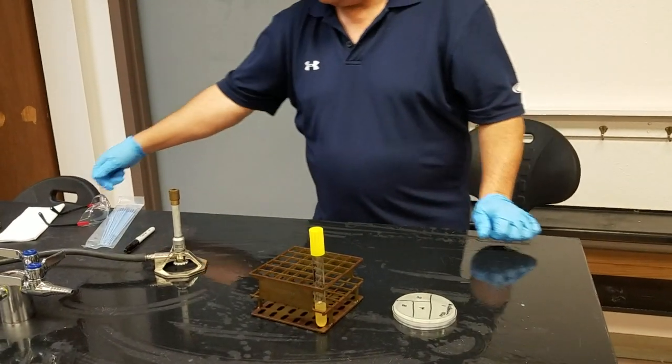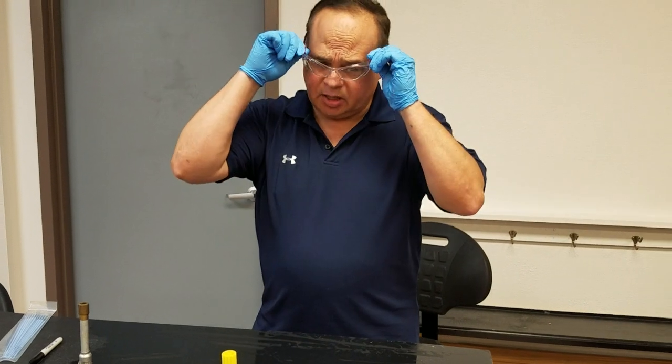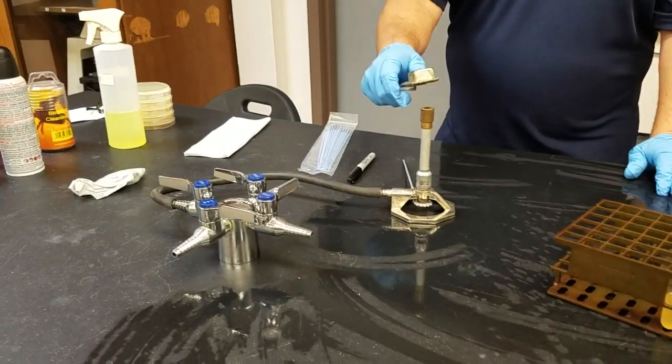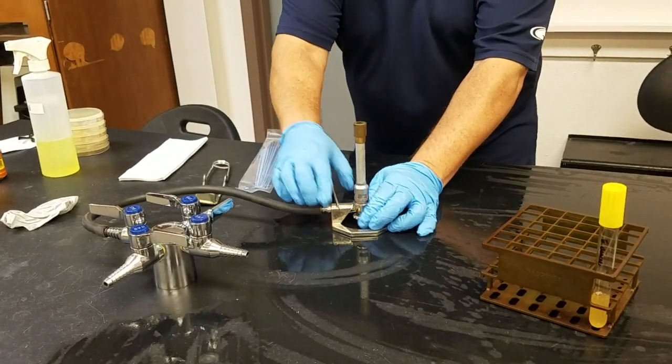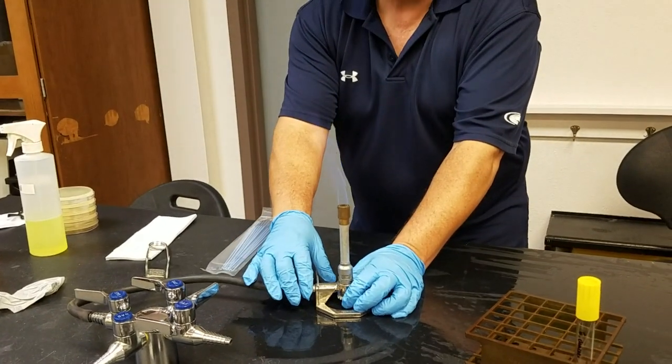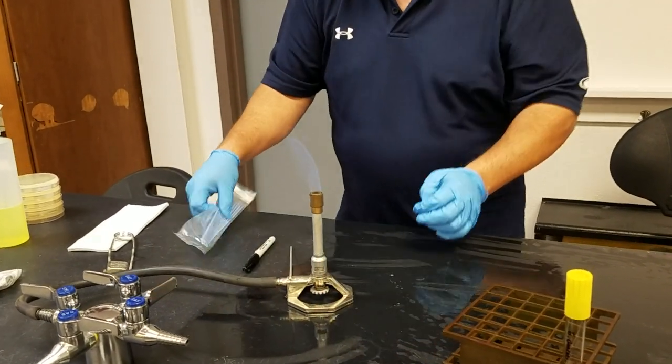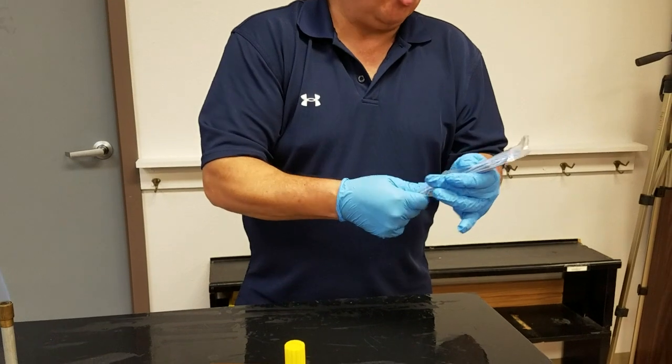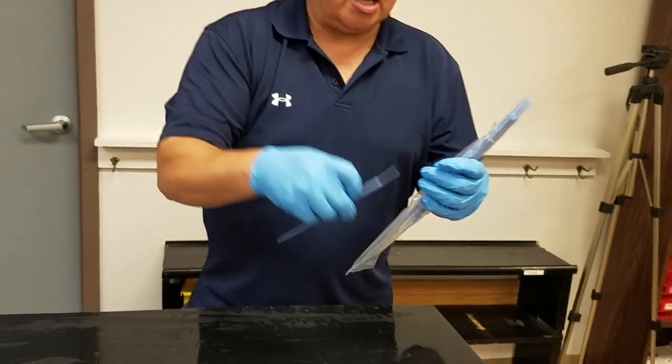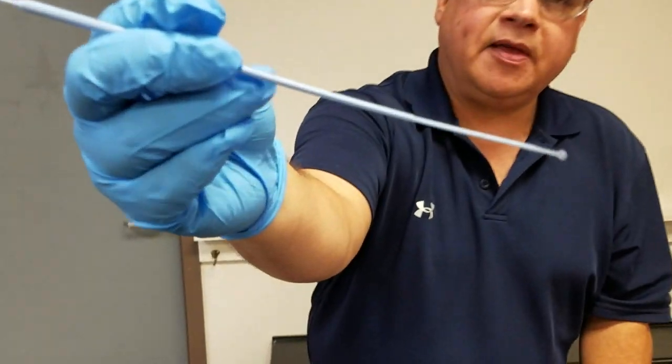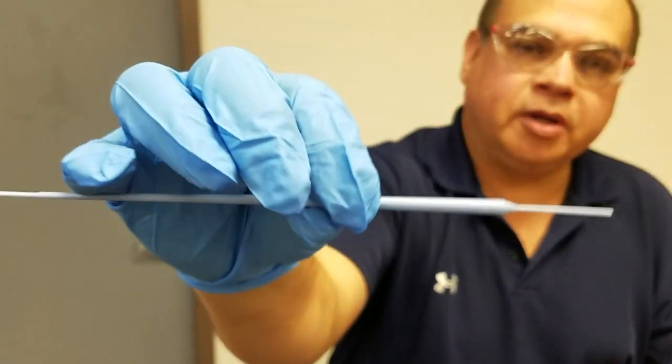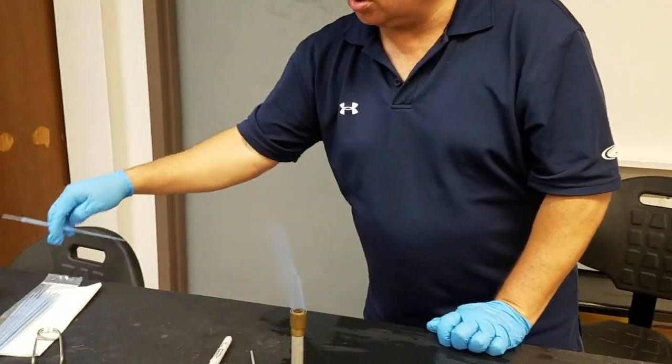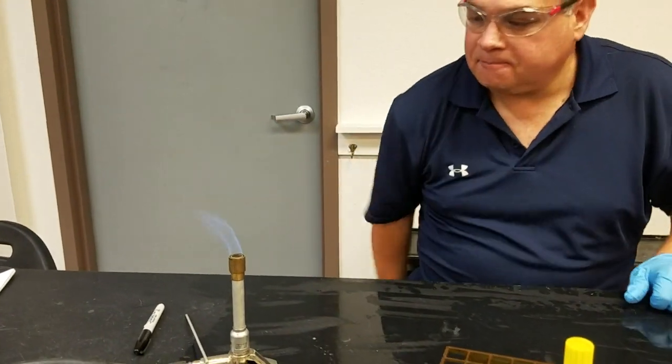There are two different ways to do this. You could use a Bunsen burner, but we also have these loops that have been gamma irradiated. If you don't have access to a flame, you can use a gamma irradiated loop. This is what the loop looks like - on one end there's a loop, and on the other end there's a needle. I'm going to do it with the loop itself.